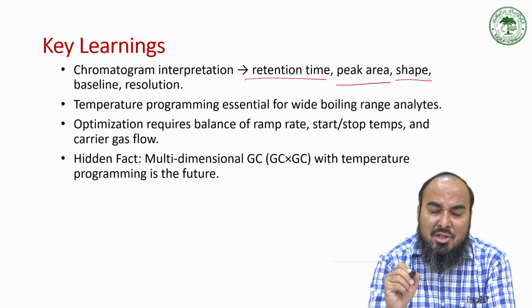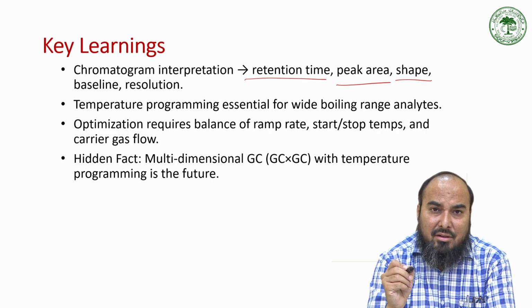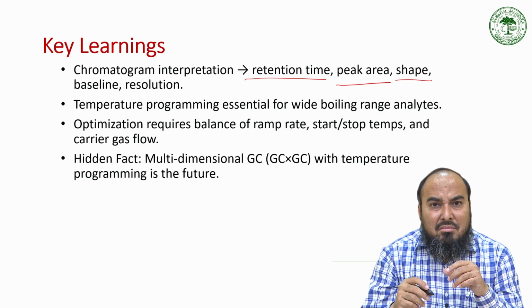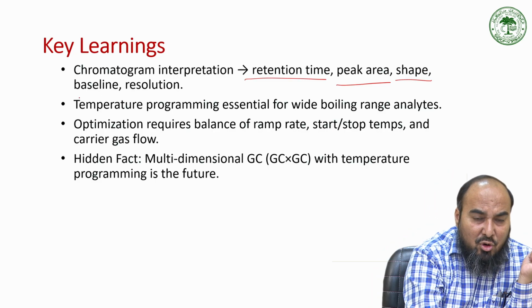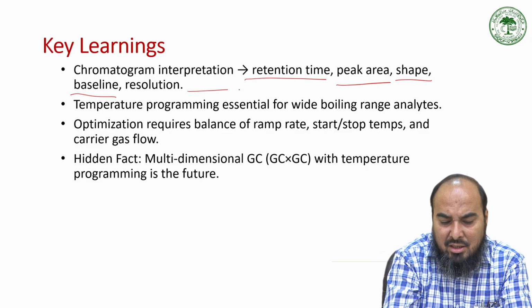The retention time is different for every component or not. If two components have the same retention time, then you can say that they are co-eluting. So you have to look whether it is some impurity or something extraordinary coming out, because two components cannot have the same TR. Similarly, you have to look for the baseline. You have to always have a very smooth baseline, a straight line like this.